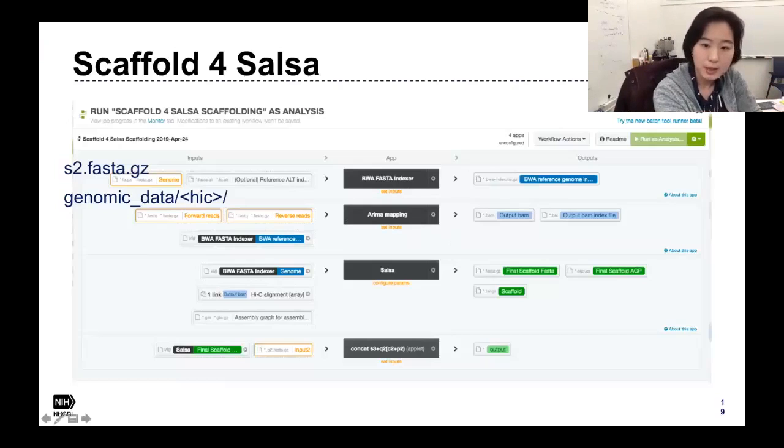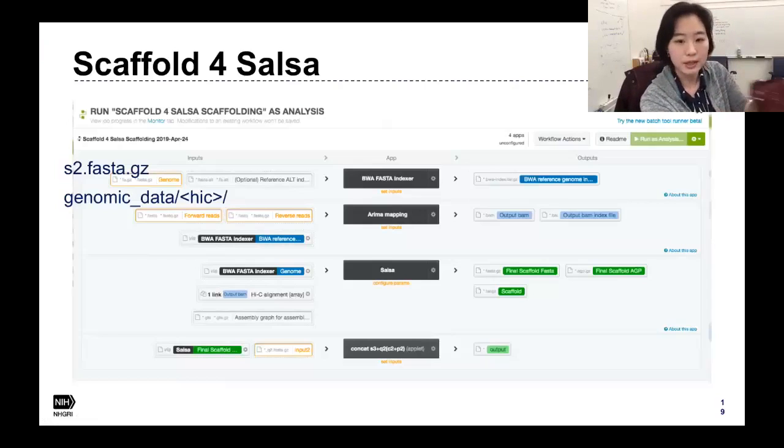So the ARIMA pipeline is aligning the reads each independently and then trims off the 5' end of when you have a chimeric read with the cutter site in the middle of a read.